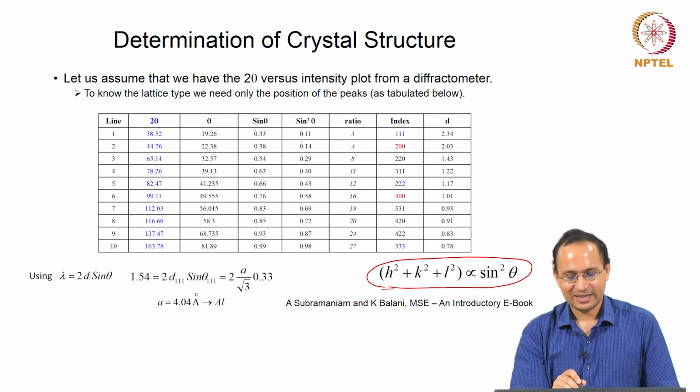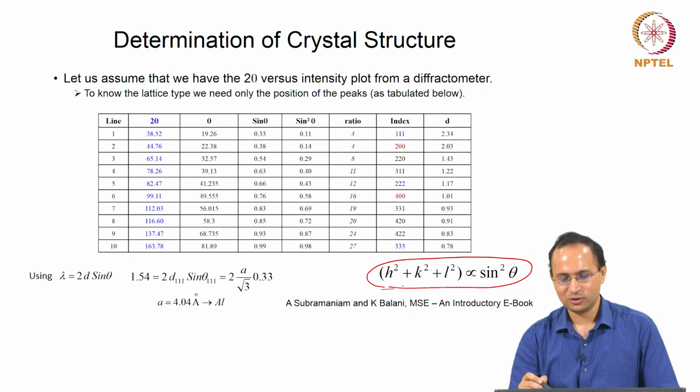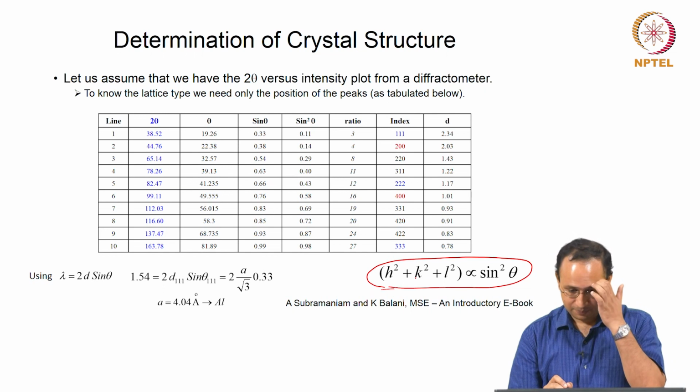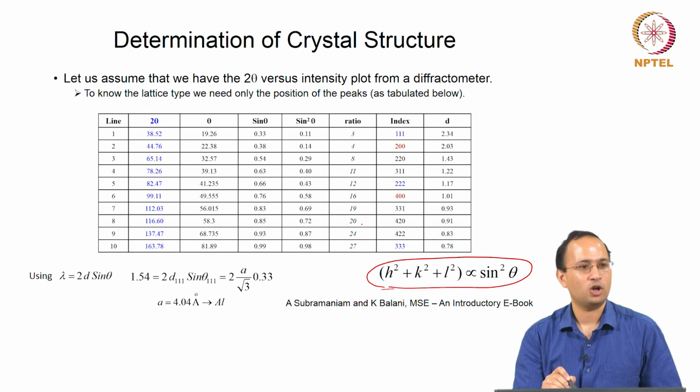Now, they are expressed as 0.11, 0.14, which does not make sense. We have to somehow get values of these HKLs. So, we normalize it again, we try to get rid of these decimal points. We have to maintain the ratio, it is nothing but normalization.